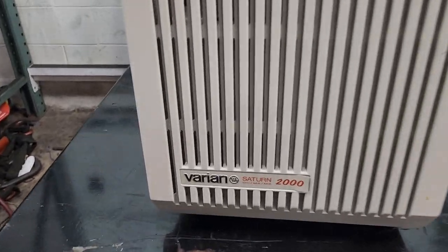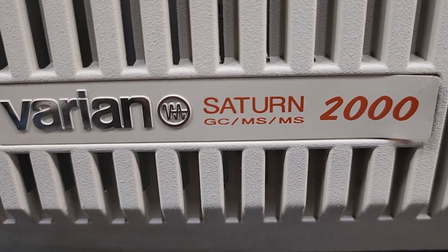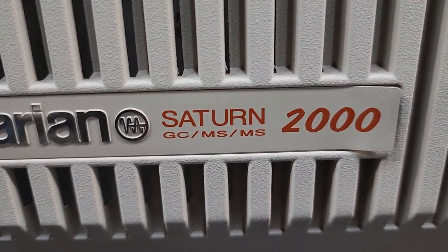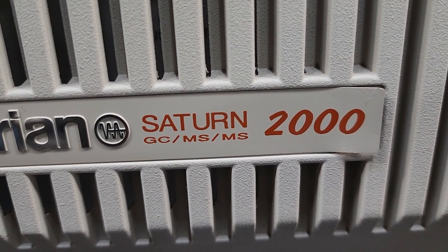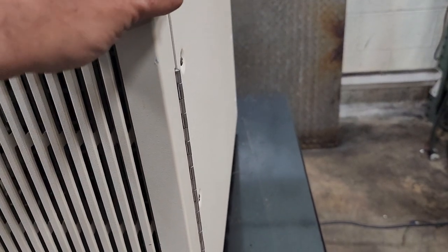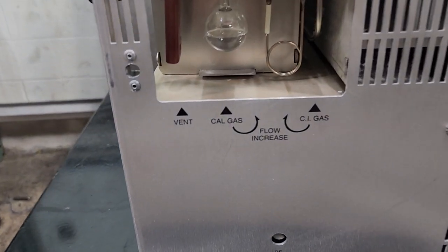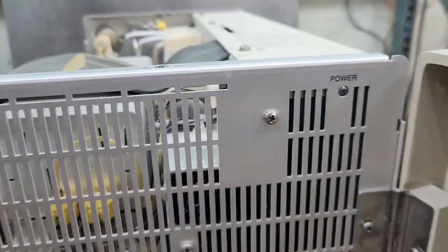This is a Varian Saturn 2000 GC MS. I think they're calling this a spectrum analyzer, but I think this is just a piece of it.